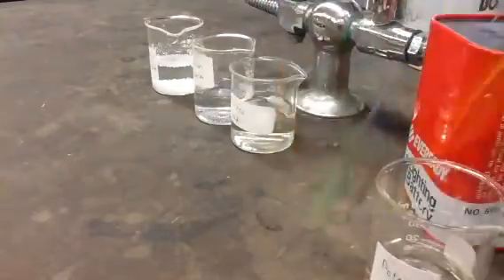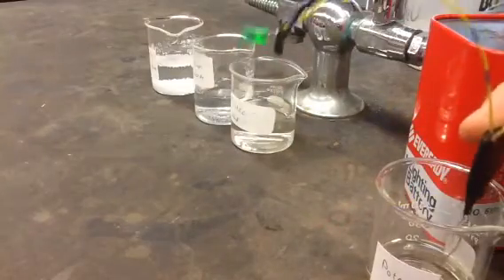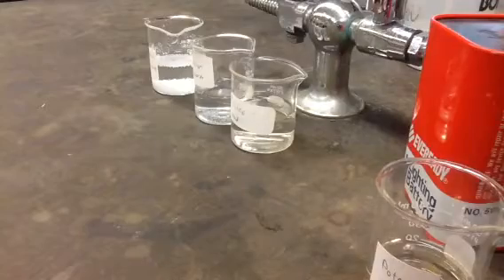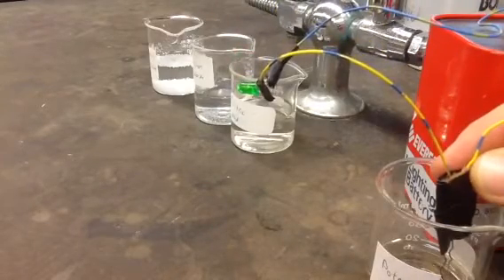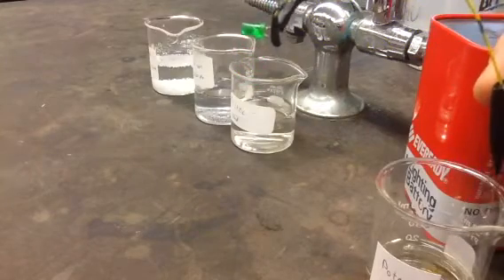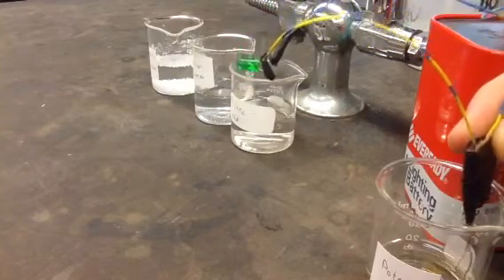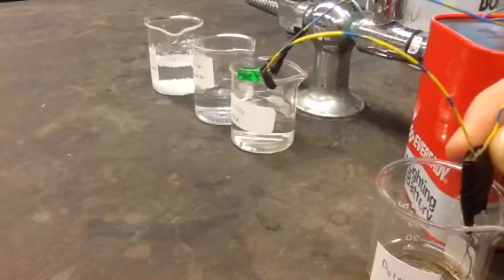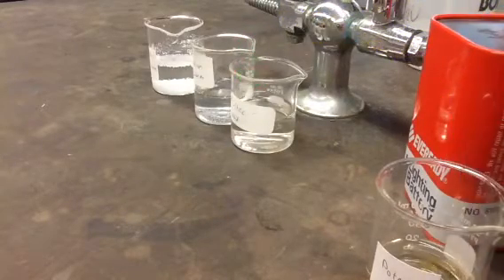This is our potassium iodide. And we get a nice light up on that, I believe. Oh yes. Lovely little light up. Nice. Nicely lit.